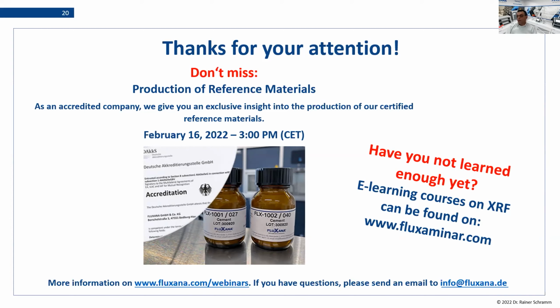Someone asked why in this auto catalyst, in this car catalyst, we measure cerium. There is indeed cerium inside, so it's not CO2. It consists of a zeolite, which is of course silicon oxide and aluminum oxide. There's zirconium oxide inside and cerium oxide as well. Yeah, definitely. And you're right, it's CeO2. Oh yeah, this is an error. Okay, thank you very much.